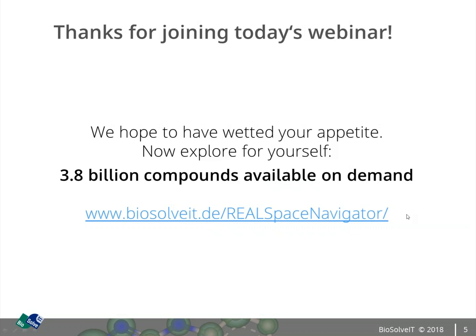And with that, I just wanted to feed in one more question that was put to Yuri. Yuri, the question was, what is the threshold for a high-score building block, and what's the threshold for a low-score building block, and what's the procedure to select them? Yeah, thank you, Franca. The procedure to select them is based on experimental data. We basically test each building block that is delivered from our chemist, and it's in substantial quantity to be tested in this parallel chemistry procedure.